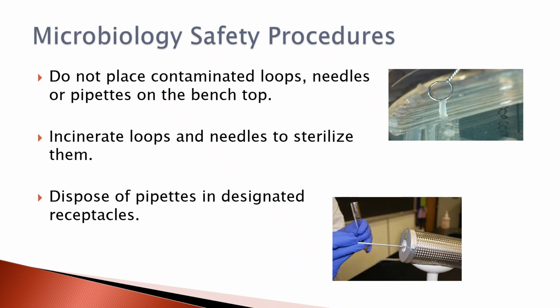Some other things to know: we don't place contaminated loops, needles, or pipettes on the lab bench. So any instrumentation that we use to move microbes around, or to manipulate microbes, is not put on that lab bench. We incinerate the loops and the needles to sterilize them, and we dispose of pipettes in the designated receptacles.